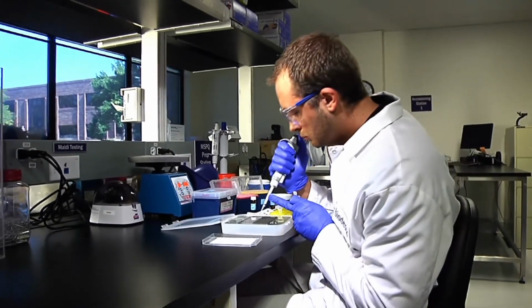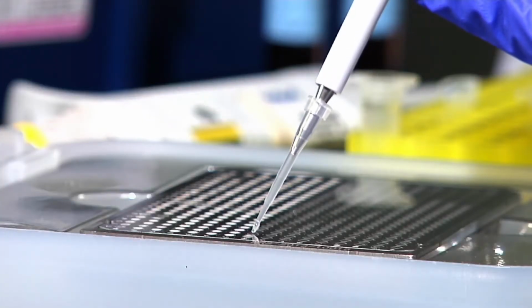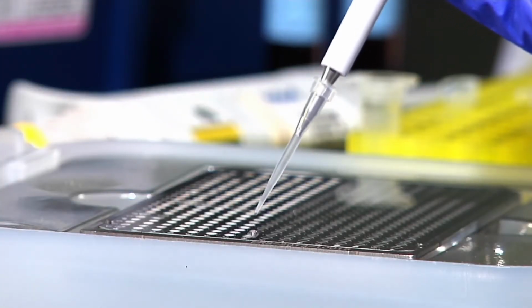What we do is interrogate the molecule at the level of its molecular weight, its composition. And so there's a dimension to the data that we get that's absolutely invisible, not apparent, not accessible by other techniques. The other thing that's important about MALDI mass spectrometry is that we interrogate all these proteins in one run. So if you wanted to develop an ELISA for one assay, that would mean one antibody, one test, one analysis, and then another antibody for the next protein.